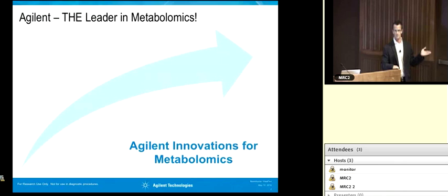Let's say you've got 15 or 20 metabolite targets you're looking at across however many data files you're looking at. Then you're going to need to integrate those peaks and basically transfer that to a spreadsheet like you saw. And then review the results, see if they make sense to you. And then as the last step for visualization, this is done in many ways. It can be as simple as in Excel. There's some open source software, Cytoscape, Adobe Illustrator, etc. But these are all usually open source, limited support type of visualization tools.